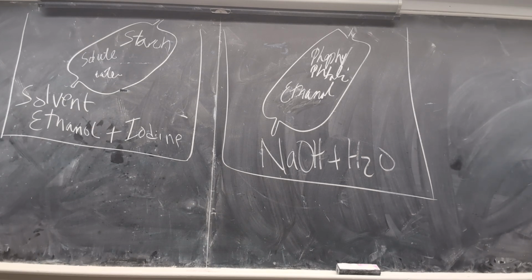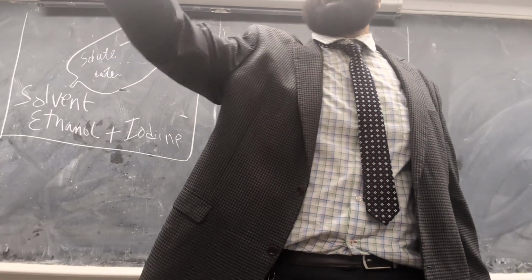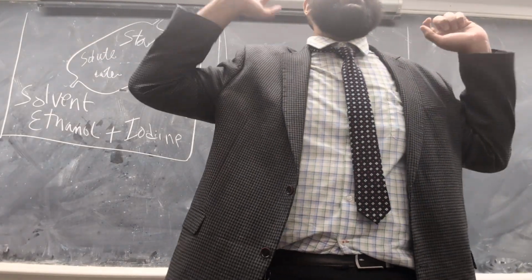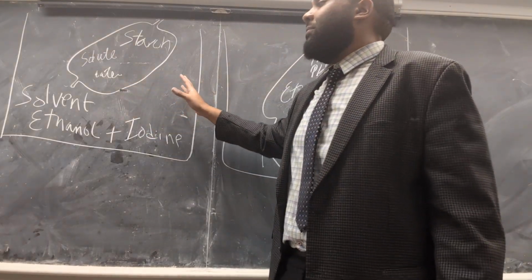Okay, are we ready? Yes, we are. So that's the first experiment. Now each group is going to get a beaker. Please make sure you rinse out all these beakers. So let's have a game plan. What are we going to do? We're going to have a beaker.